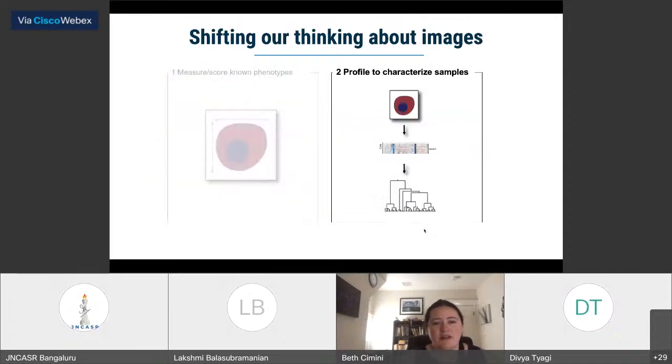So that's what I'm going to tell you about CellProfiler. And I'm then going to shift into talking about, I made a big push just now on measurements and capturing lots of measurements. And a lot of times people might think, well, I don't need that many. I only need the 1 or 2 things that I know that I care about. But I would like to hopefully convince you over the next half of this talk that, in fact, sometimes it can be valuable to capture measurements, even if you're not sure how they'll be useful. We call this morphological profiling. And it's really about finding the unknown unknowns in your biology and finding things that are not necessarily what you expected to look for.